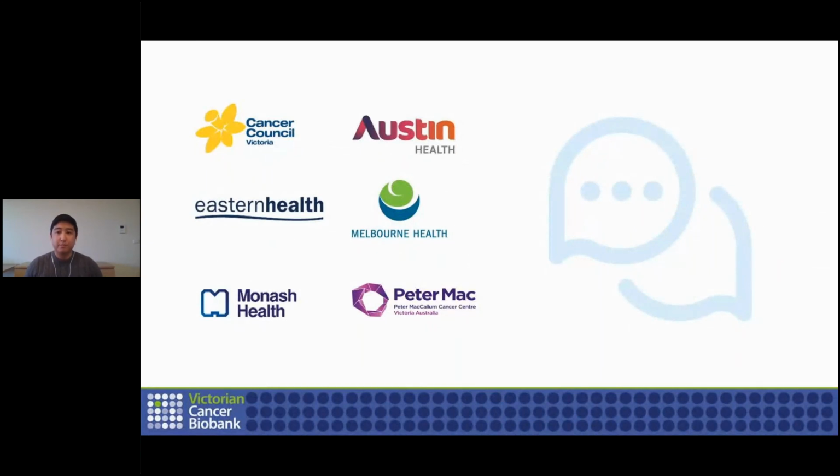The next one from Chris is about accreditation, from the NPAC information and communication standard perspective. How do you validate the data in and out? I'll let Duncan add if there is anything more. But what we had done with VCB is that a couple of years back we started a project for them for data validation. One of the slides that Duncan had up was a specific slide about data validation. You can define a lot of data validation rules on your data elements to make sure that data coming in is valid. These rules can be very specific to your protocols. For example, if there is a protocol where only females are allowed to register, you can define a data validation rule saying that gender can have only females, and that's how they do the data validation part.